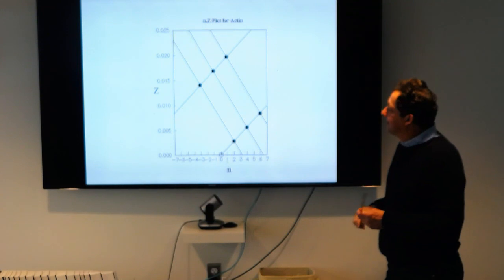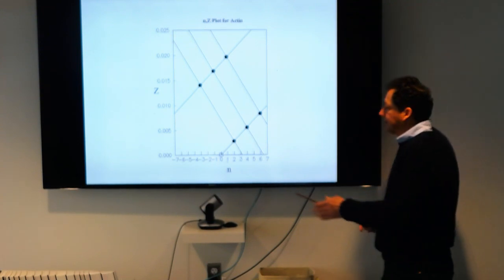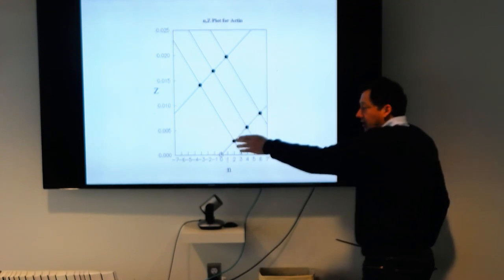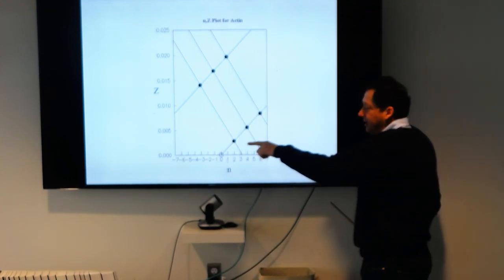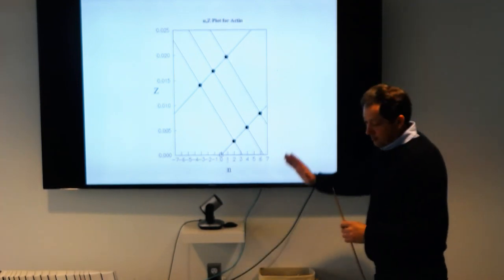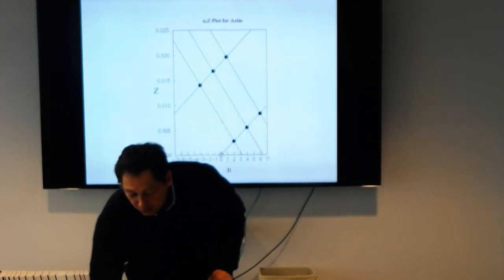So the idea is, you have your diffraction pattern, and you assign each peak to one peak on these layer lines. Okay, so that's what you need to do.